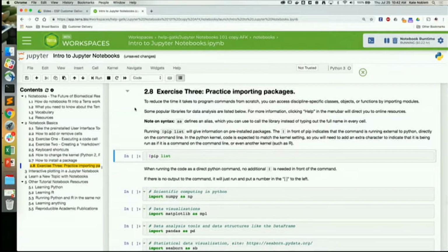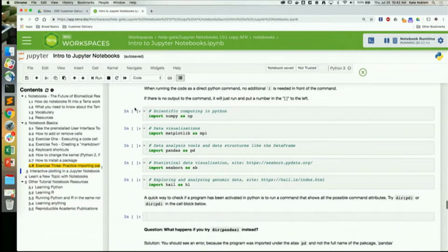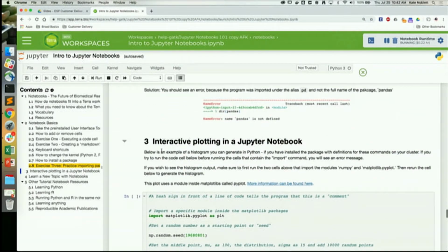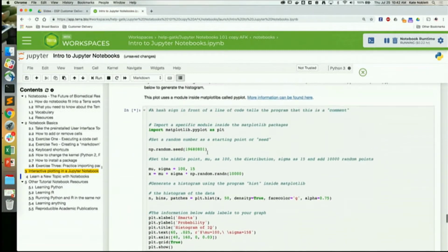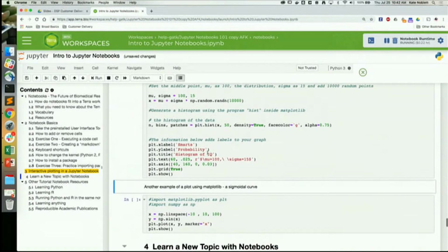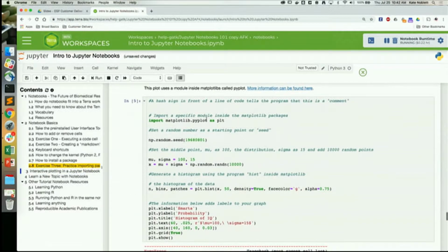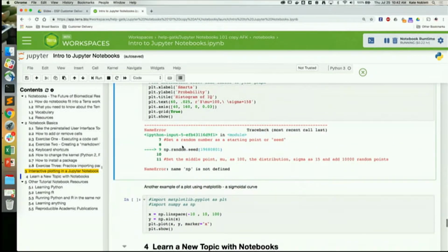Yeah, and then the rest of this notebook is really just a do-it-yourself kind of thing, where you go through and import the packages just as it describes to do, and it gives you some nice examples of how to generate some visualizations using, oh, actually, I'm sorry, this wouldn't work right now because I did not click to actually upload the, yeah, so it's a little confused.